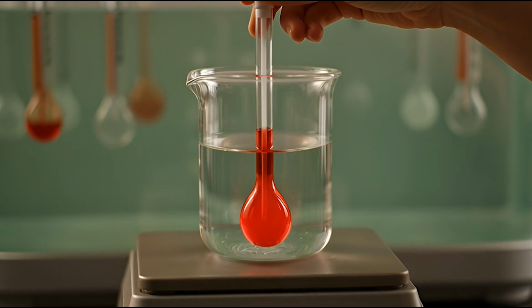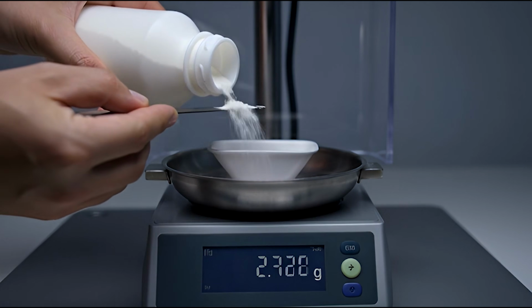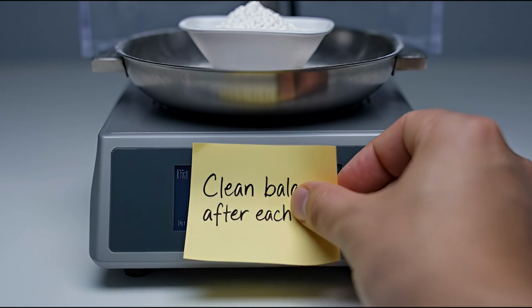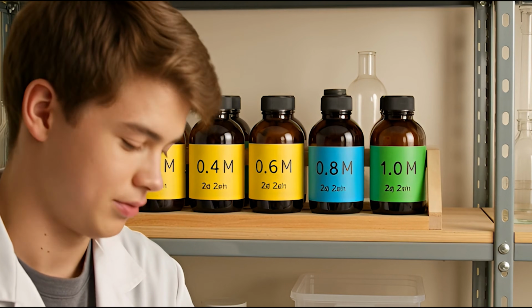Ready to titrate. Thermometer, hold by the top, stir gently, don't touch the bottom or sides, and never hold the bulb. Weighing, use a spatula, add slowly, tap gently. Clean the pan after every use. Contamination ruins accuracy. Label everything. Concentration, date, your initials. Never trust your memory. A labeled bottle is a safe bottle.